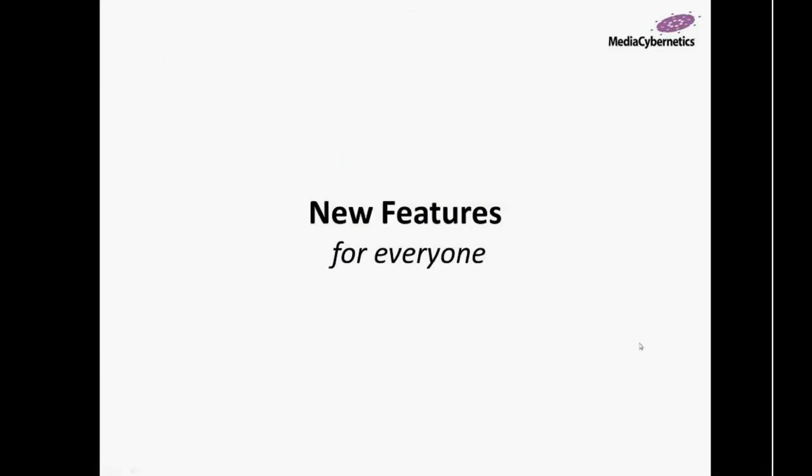Thank you, Jeff. Now what we want to talk about is a few additional features that are not specifically features for an individual, but more catered to the entire group of users for Image Pro. I wanted to make sure that, in general, from version 9.0 to 9.1, there were significant improvements, that people noticed a difference in the software they're upgrading to, and that there were improvements that made everyone's life a little bit easier and made it easier to customize the software for your needs.